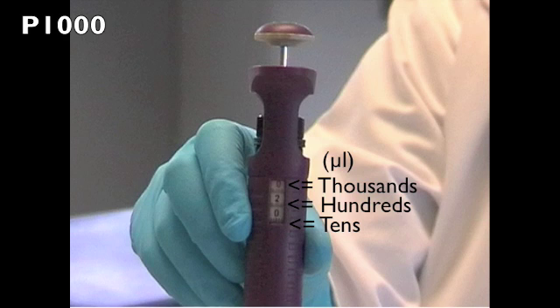On the P1000, the first number which is red represents thousands of microliters, the second number represents hundreds of microliters, and the third number represents tens of microliters.